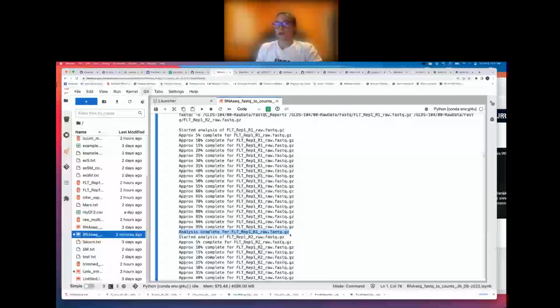That'll tell you that, okay, it successfully completed the analysis. We don't see any errors. So if you remember when we were running Unix, anytime we had something wrong with our code or there was an issue, we saw errors printed out. So this is what you're looking for when you're reviewing the standard output of these tool scripts: you want to make sure that you're not seeing any errors or anything that would be of concern in the standard out.